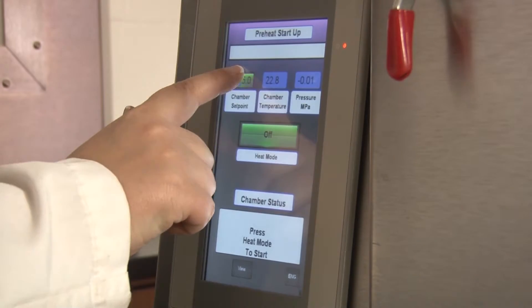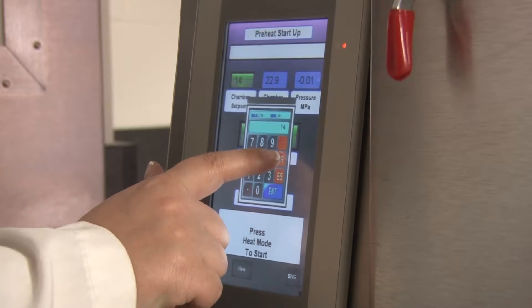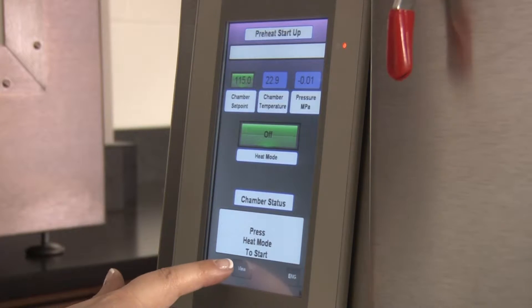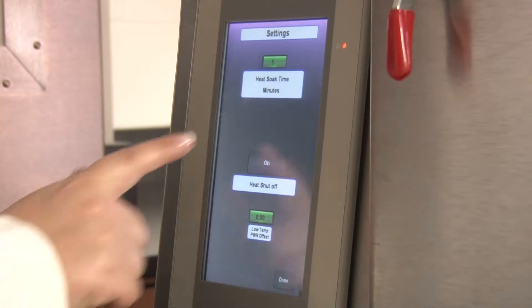This rugged unit easily enables users to control total operation through its touch screen controller. The intuitive interface allows for quick setup of any unique setting for test temperature and test time.